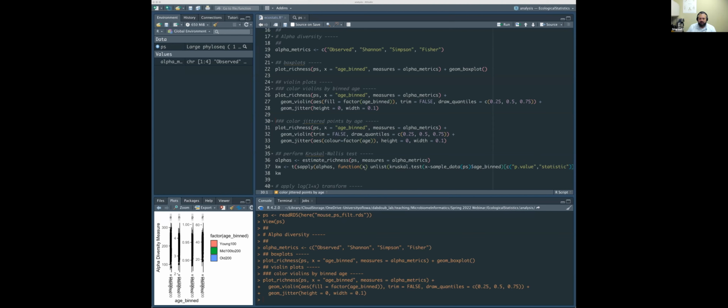If you look at each of these sideways, it's a histogram distribution, or a kernel smoothed histogram of the underlying data distribution. And then on top of that, we've added a jitter scatter plot to the violins, so you can not only see the distribution with the violins, but actually see the data points themselves and how they're distributed. Adding this sort of information on top of box plots is useful because sometimes the smoothing will obscure aspects of the data. So actually looking at the data points in addition can be useful.